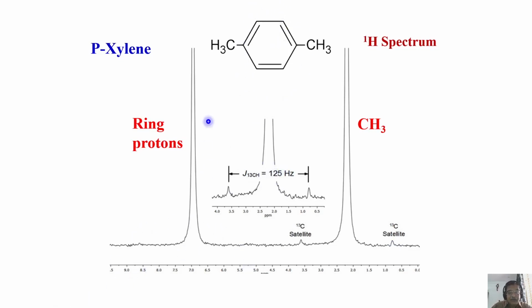Of course, if you see the case carefully, if you do the experiment, acquire signal for a long time and enhance intensity, you can measure CH coupling for these ring carbons also. But I don't want to disappoint you. If you carefully see, you see a peak here and this peak.